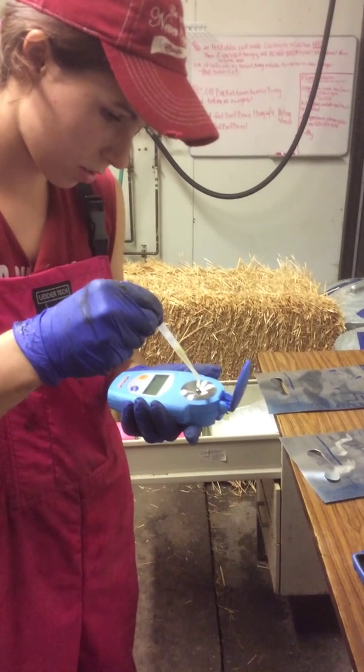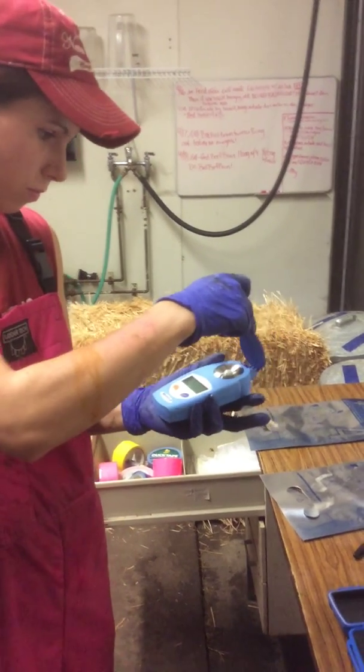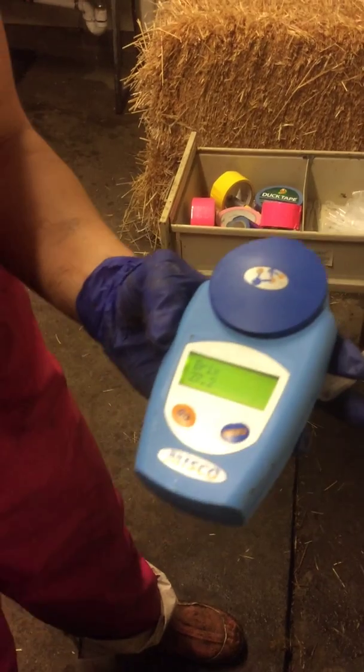A small sample can be drawn up through the pipette and one to two drops can be placed onto the BRICS reader. The top can be closed and the go button on the left can be pressed again.